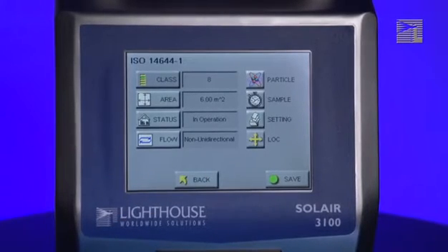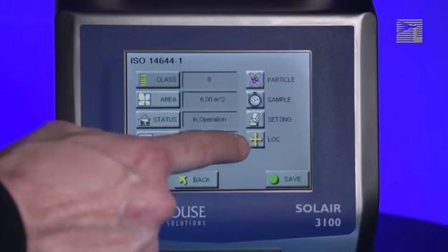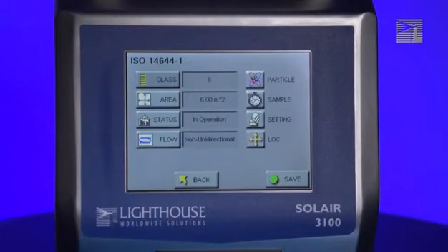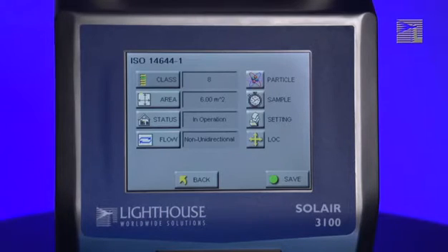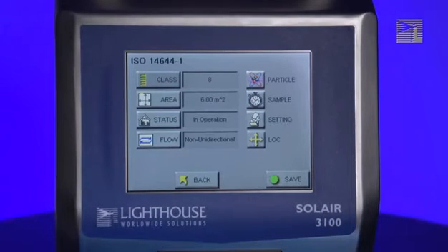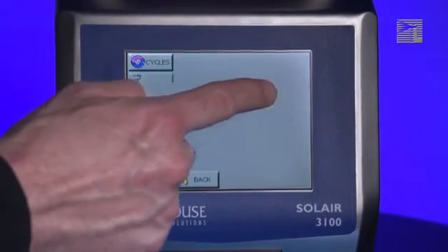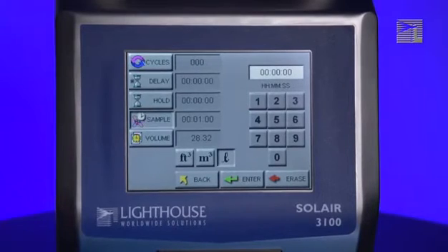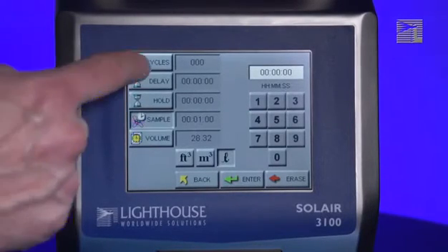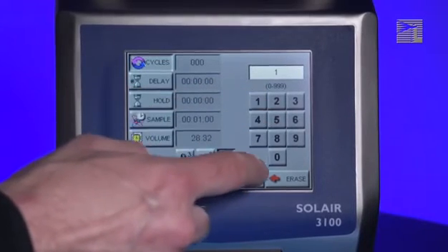The buttons on the right side of the report settings screen specify how the sample will be recorded for the report. Note, however, that there are certain settings that are particularly important when running a report. The number of cycles and the volume of air in each sample may be set via the Sample button. It is not necessary to run multiple cycles when running a report; usually the cycles field should be set to 1.